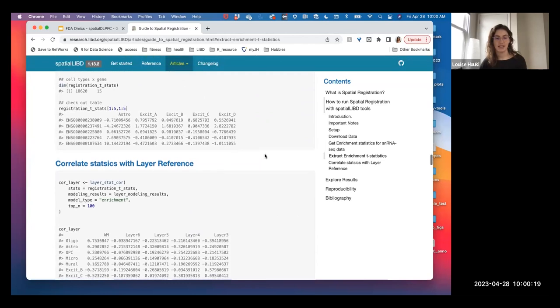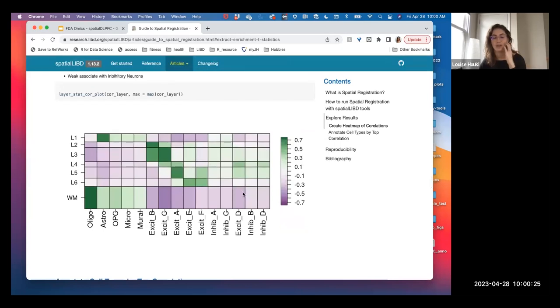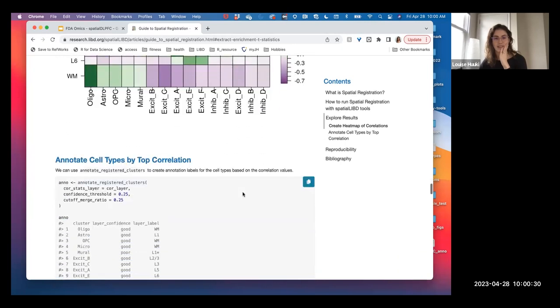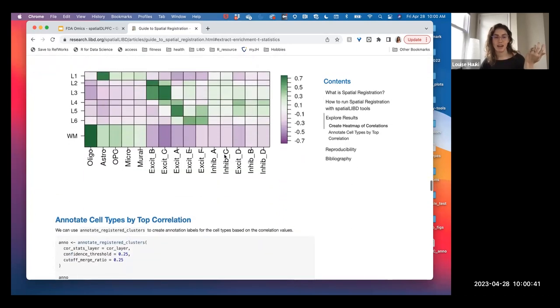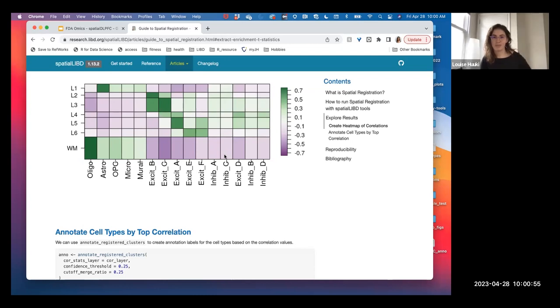The code from today's lesson will be in here as a good reference, and here's a nicer version of that plot we were trying to look at. It's 10 o'clock. If anybody has any last minute questions — this is a very useful process to compare and contrast these data sets. There's lots to learn about this whole topic. If anybody wants to talk more about that, I'm happy to help.